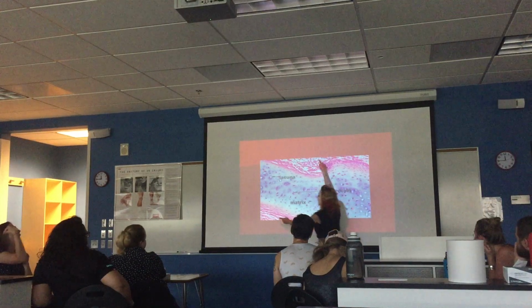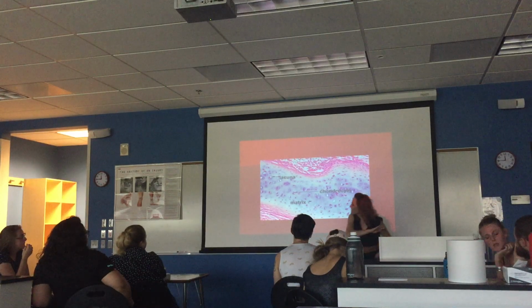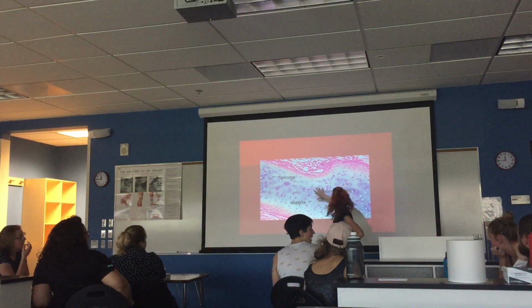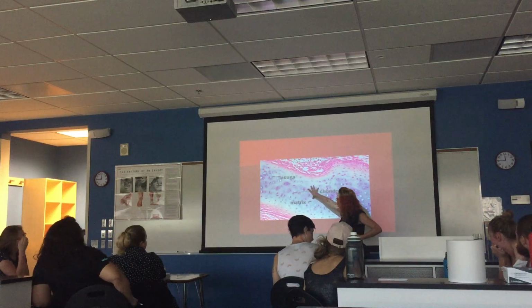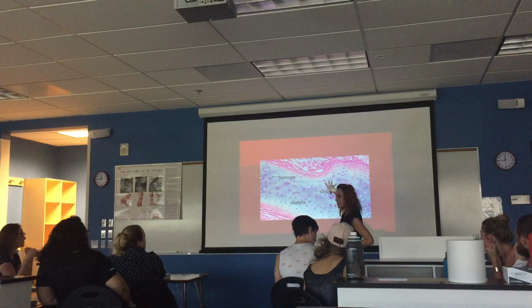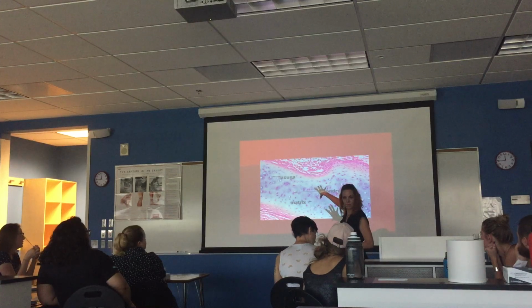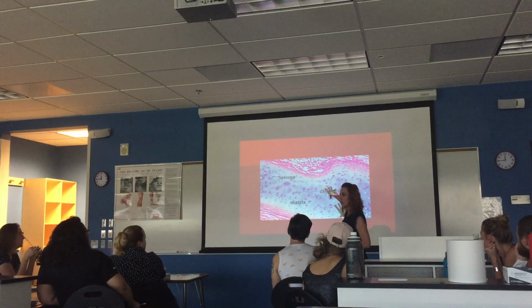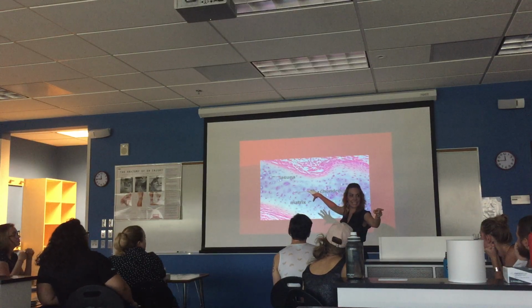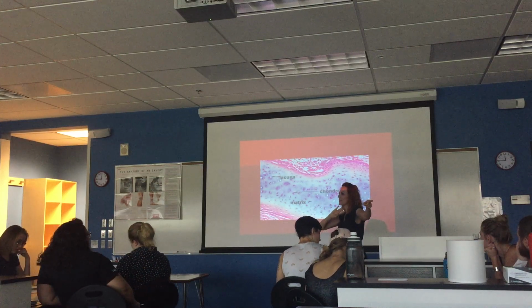Cool. More connective tissue back here. And if this was a trachea, and I were to slice the trachea, and I were to get up in the airplane and look at the rest of the slice and see what else is here, what else would I have? Close. No. The ciliated pseudostratified columnar epithelial tissue with goblet cells that's inside the trachea, remember?